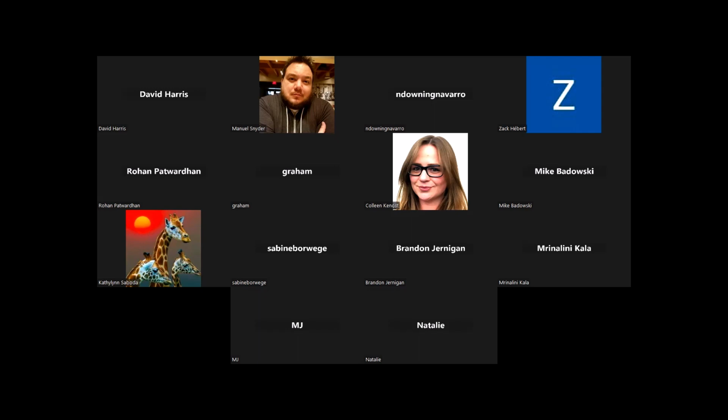The ones that are comfortable requesting the specific samples that they know they want, they can do that. The ones that know they want, like, one plasma from the first events or that kind of thing, we can build the queries for them, because they won't necessarily be familiar with building queries the way that we want. But we'll see how the catalog looks, because it might be usable for more people. Okay, thank you.